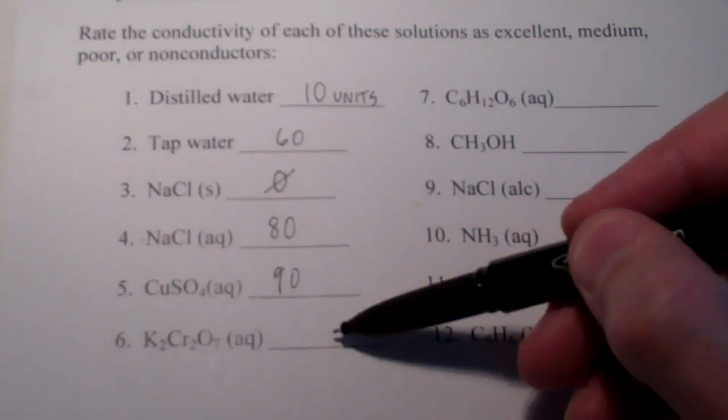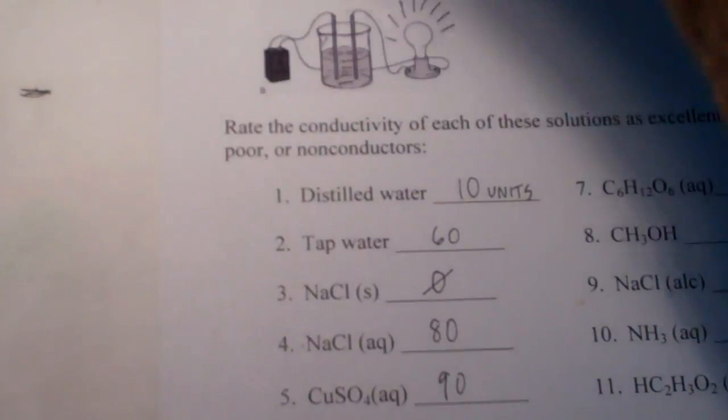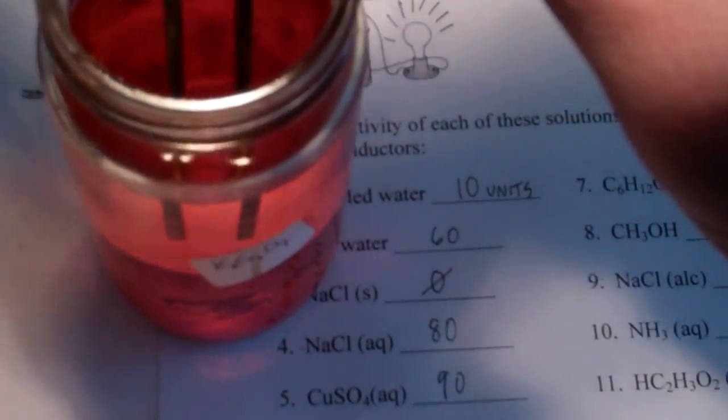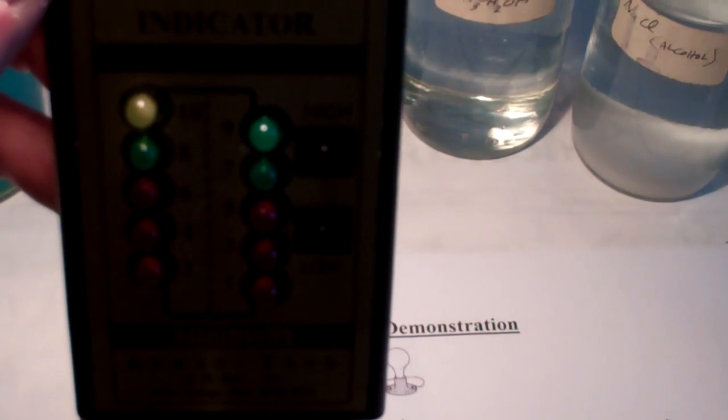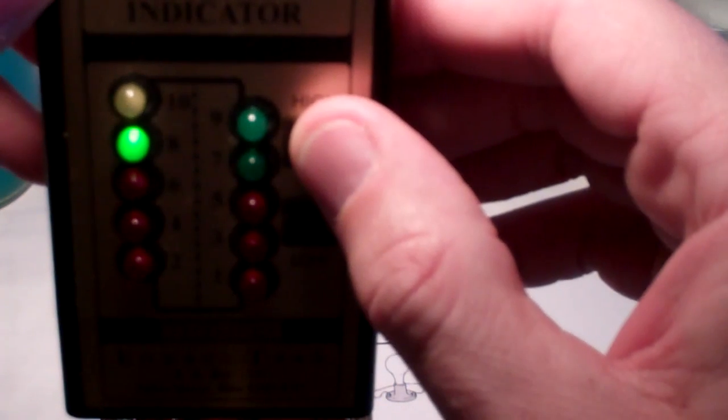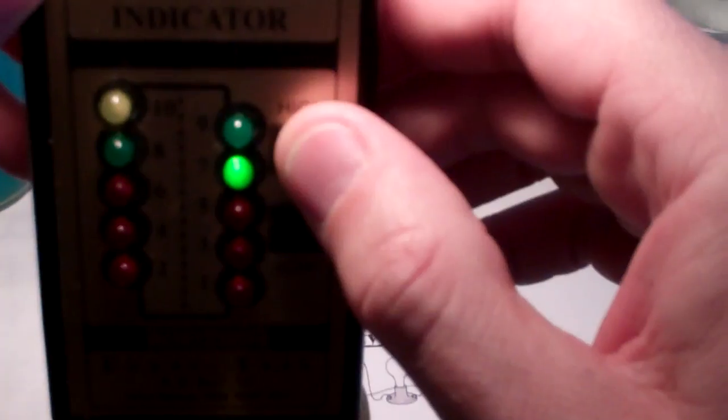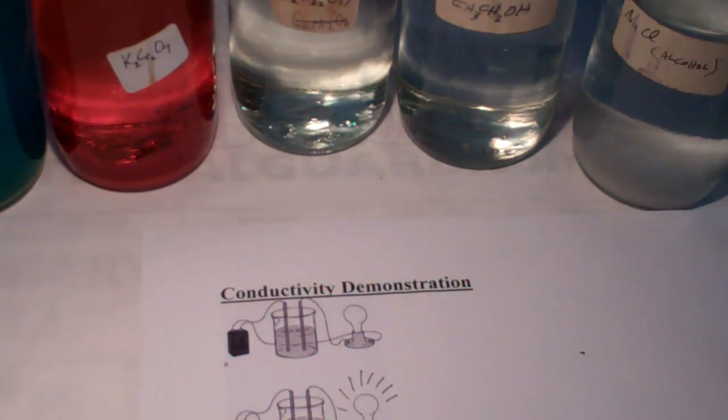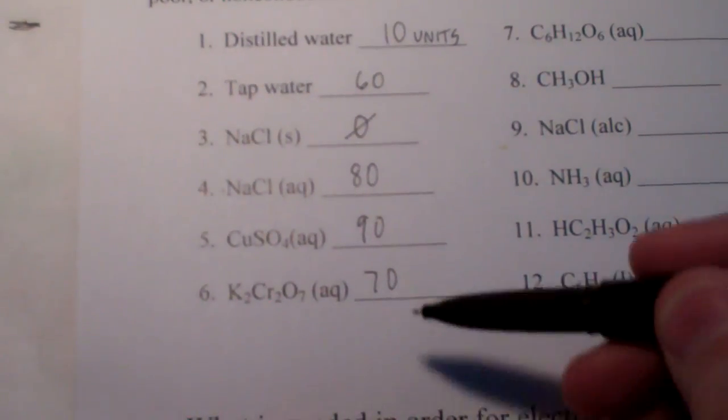What about potassium dichromate? Well, that's ionic. And that certainly is soluble in water. As you can see, it's a nice pretty orange solution. So, let's take a look and see what the conductivity for potassium dichromate is. Here we go. We will press the low button. And it says 10+. So, we'll go to the high. And that is up to 80. So, do that again. Drop down to 70. So, we'll go low. High is up to the 7 on the high. So, that would be 70. So, that's pretty high as well. So, we have 70 units for our potassium dichromate dissolved in water.